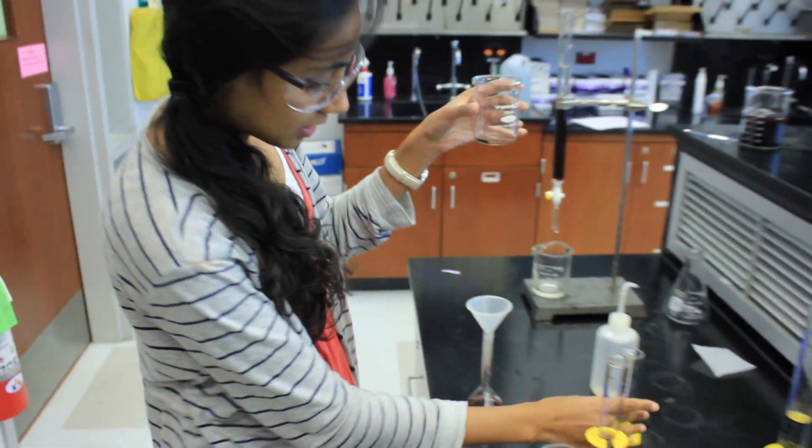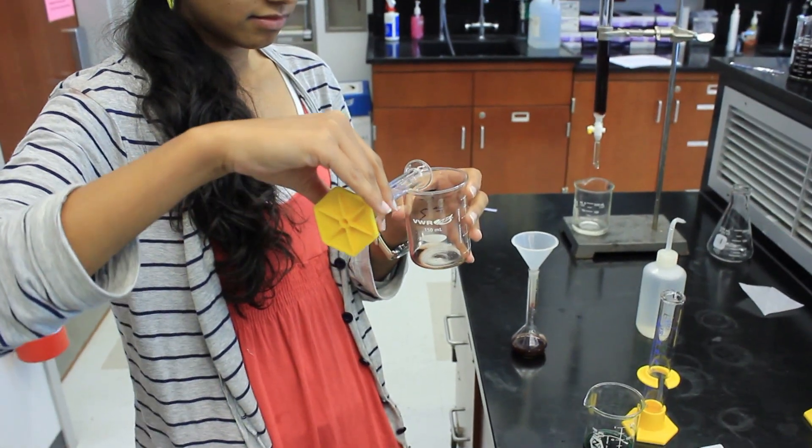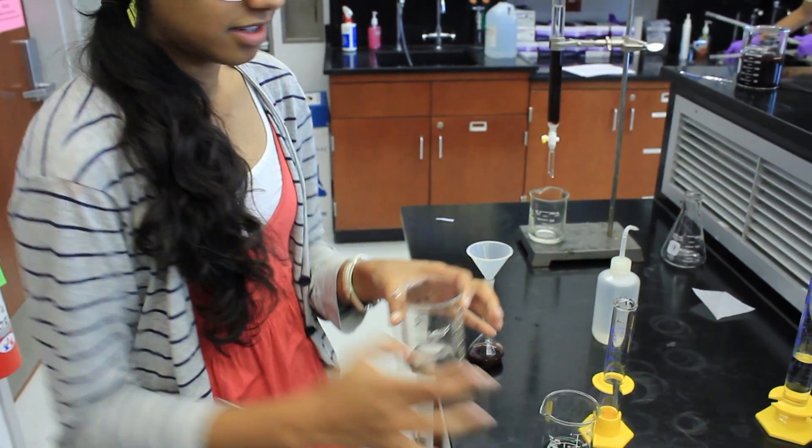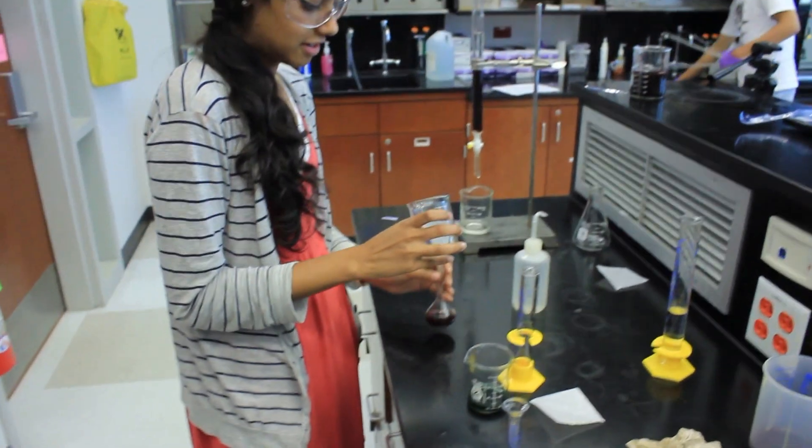And then you're going to rinse the leftover zinc with 5 milliliters of water. You're going to swirl that around and just pour it in here.